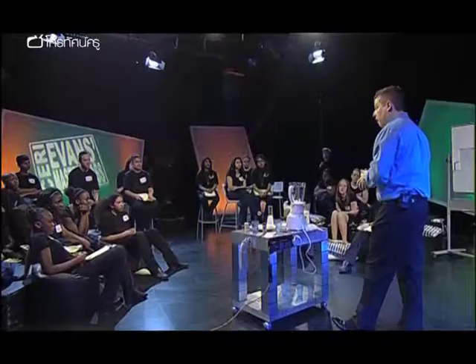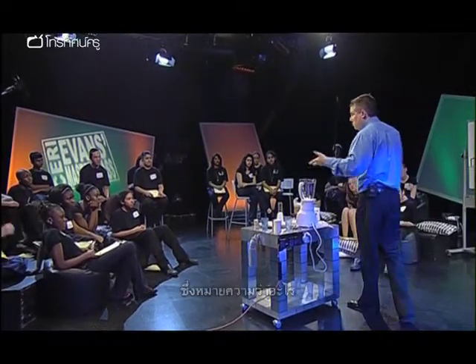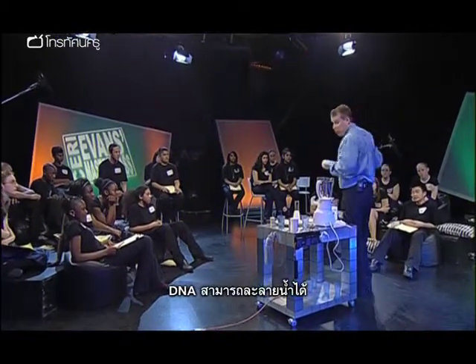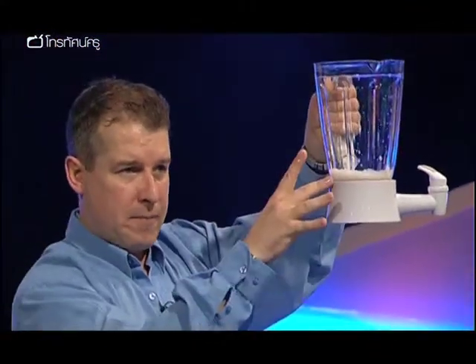Can you see any DNA? That's because DNA is actually soluble in water. It's soluble. What does soluble mean? It can dissolve. It can be dissolved, yes. So what we have is the DNA which is dissolved in there.